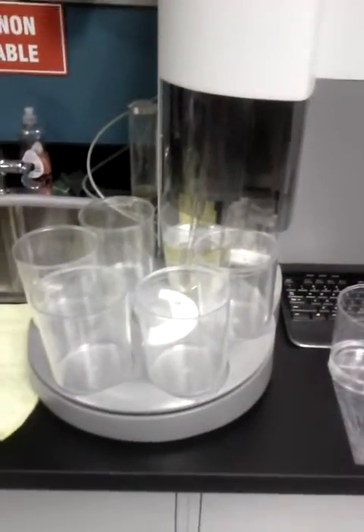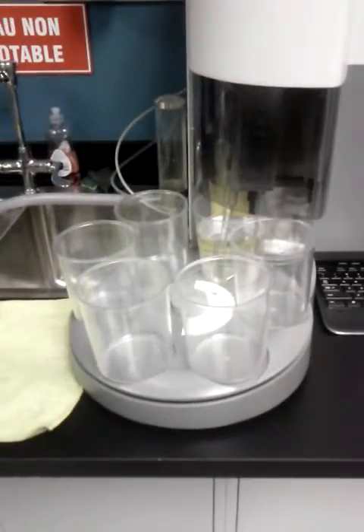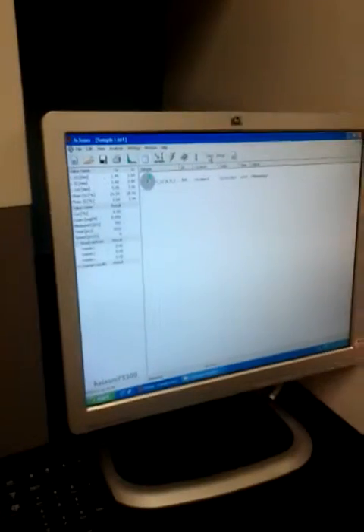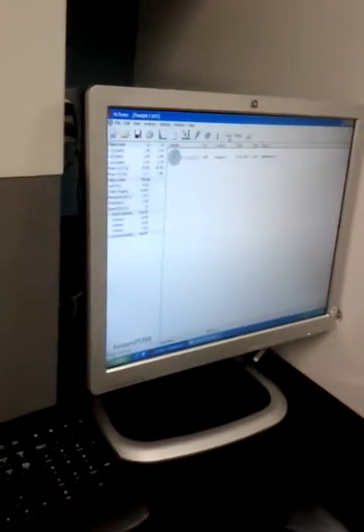And how long does it take? It depends. To finish one full glass, it's about 10 to 15 minutes. But what I do, according to the research that I found, it's recommended to analyze between 4,000 and 5,000 fibers. So once I get 5,000 fibers measured, I stop. Because I don't want to spend all my day with a single sample. So it depends what you want.